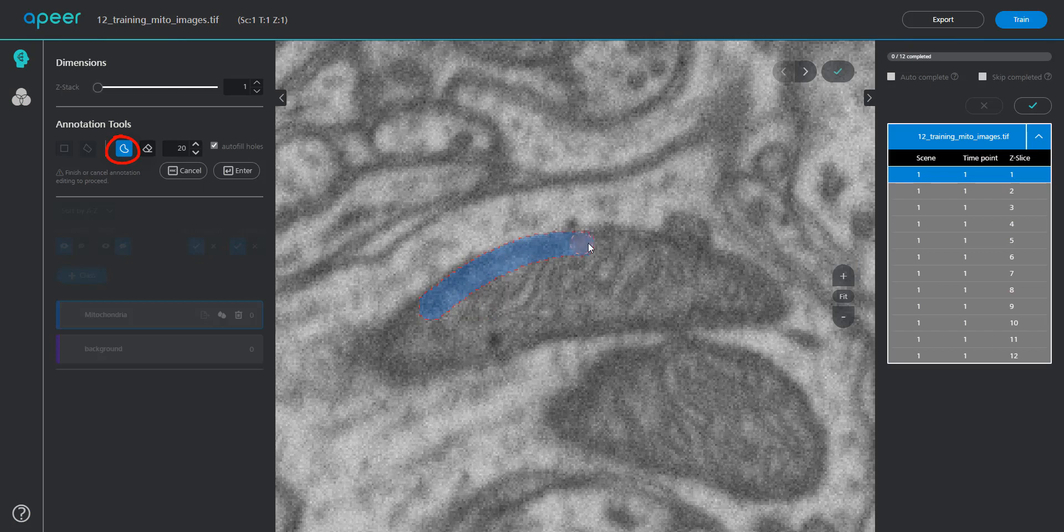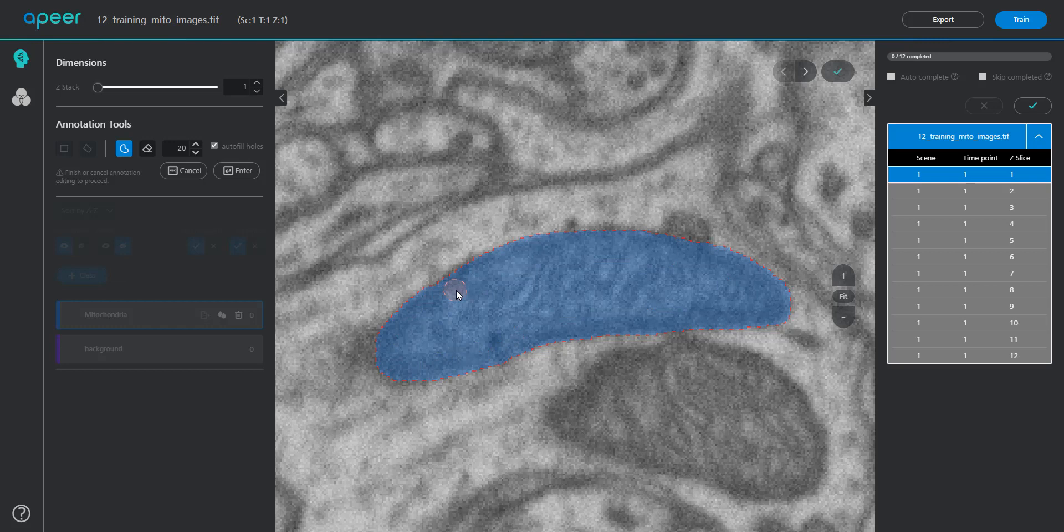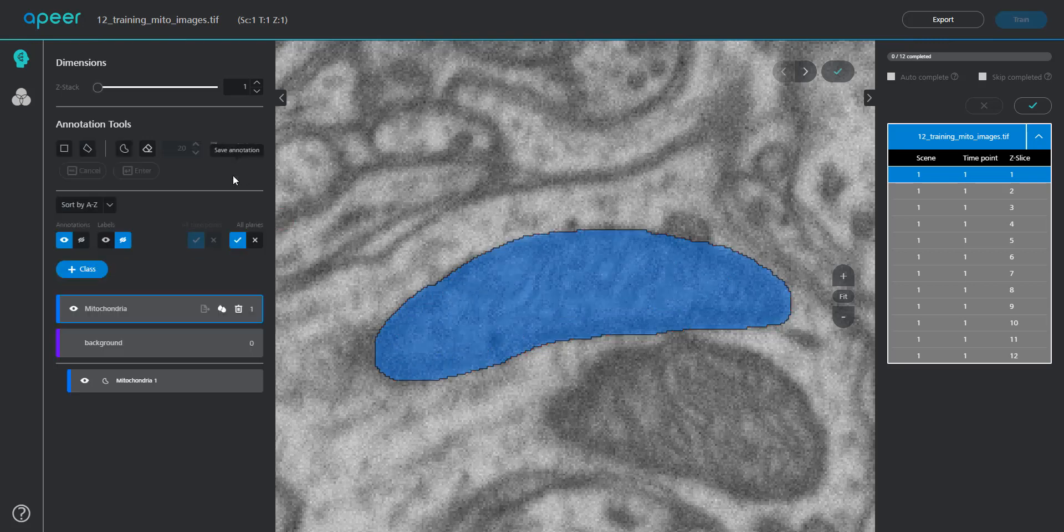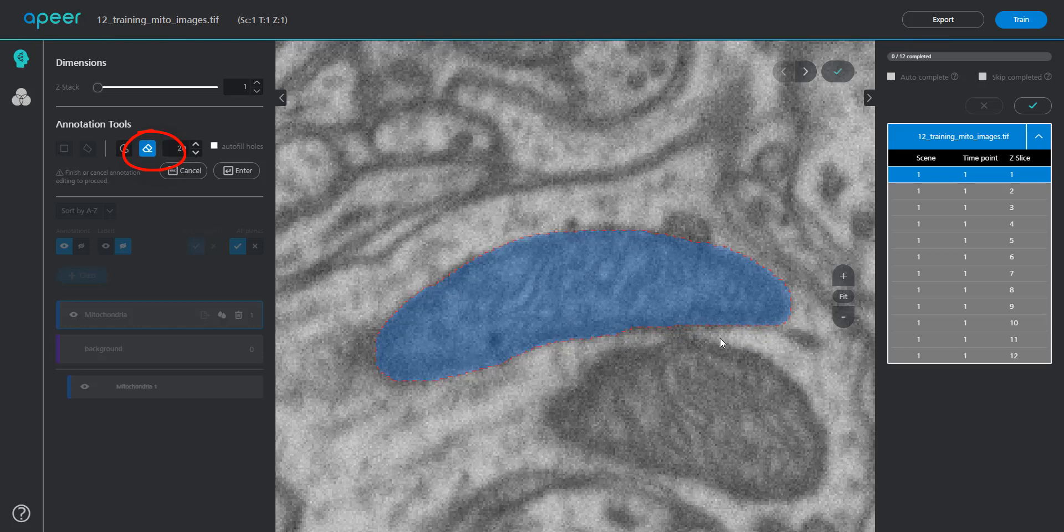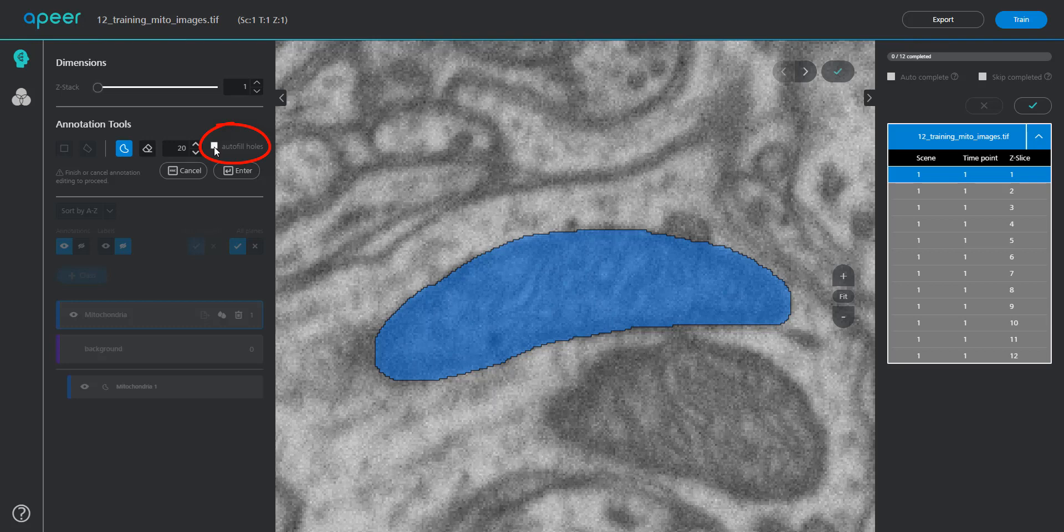Make sure you pay close attention while defining the boundaries, as they are often the tough regions to accurately segment. If you make any mistakes by overdrawing the mitochondria in this example, you can use the eraser tool to correct the mistakes. Please make sure you check the autofill holes button to close the enclosed regions.